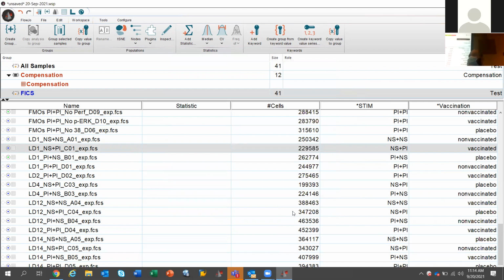You could also do a series of 1, 2, 3, etc. And then you could tell FlowJo to auto-calculate that. It works very similar to Excel. Now that brings me to the point of Excel. If you have keywords in Excel, rather than typing everything over, copy the cells in Excel and then just paste them into FlowJo. FlowJo will recognize these and then just add your keywords.